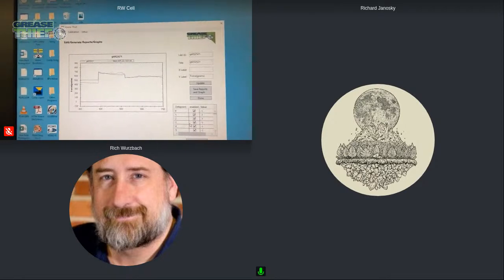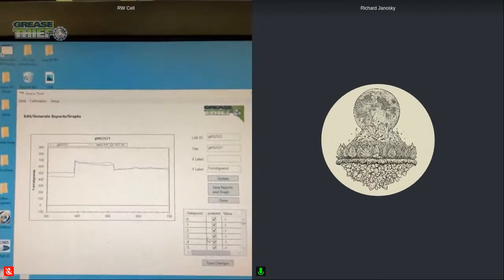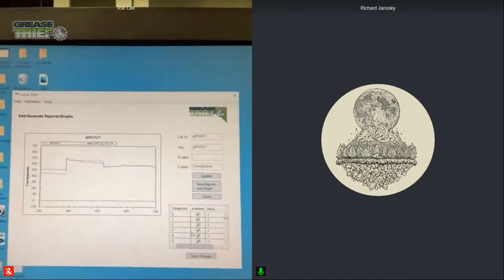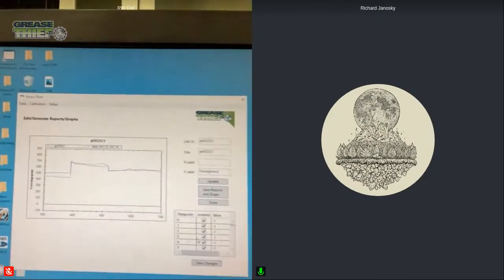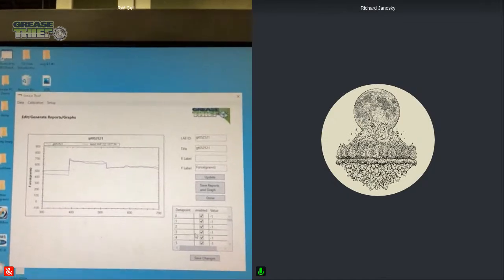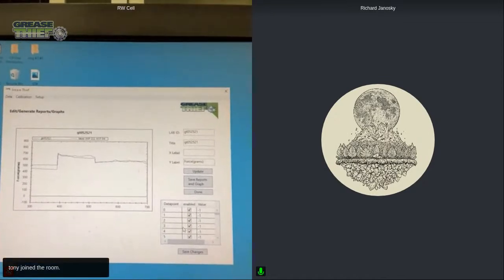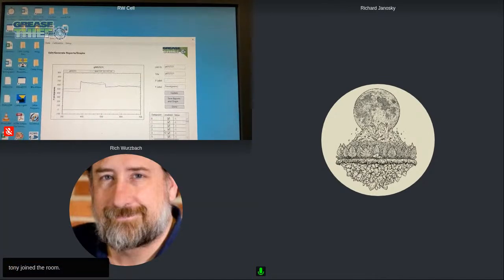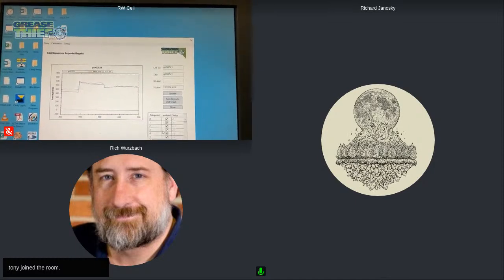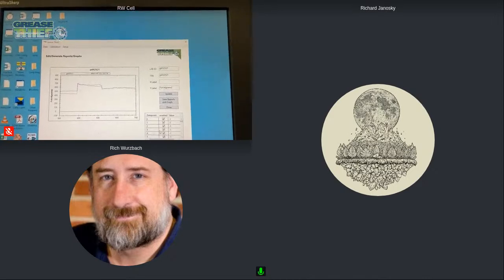So this GTI would be very, very close to 100. And 100 is kind of our goal. Obviously, we're not going to always be perfect as the reference lube is, but the closer you are to 100, the closer your grease is going to be performing as it's intended and as you want your equipment to be running. And as our GTI, or grease thief index, gets lower, then our grease is going to become softer. In some applications, this is normal and expected.